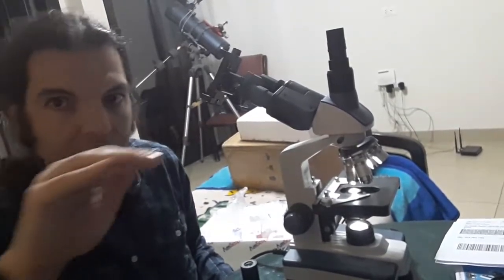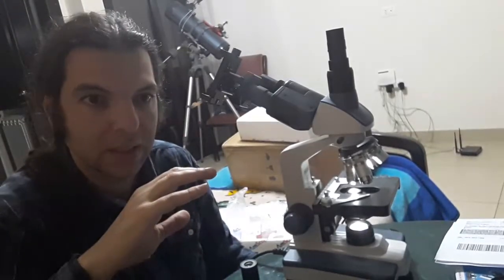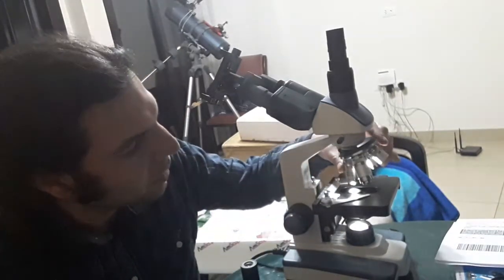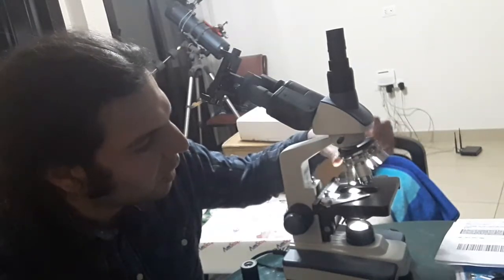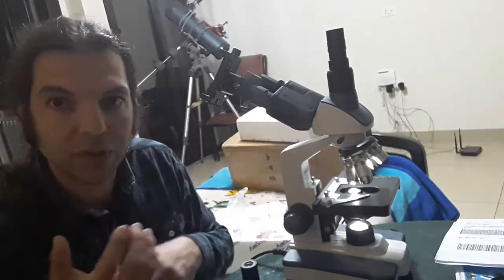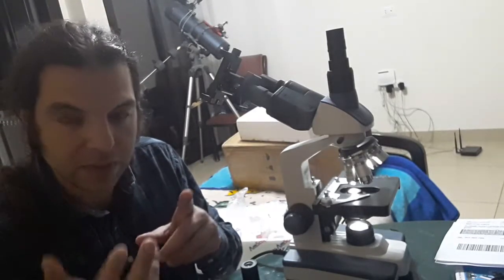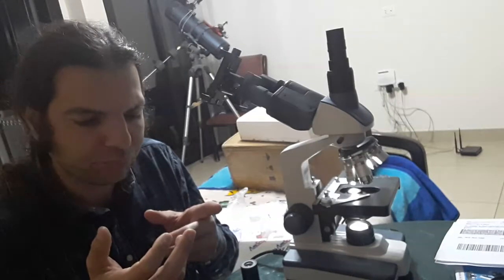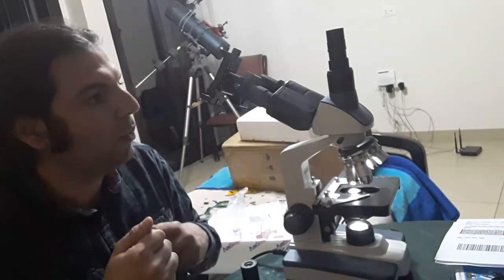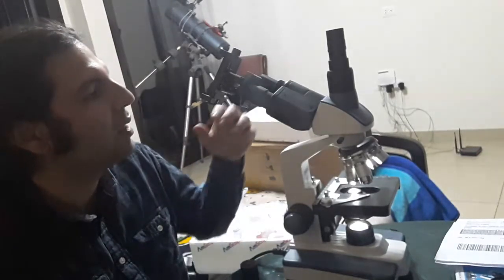You can take pictures with it, but the orientation is landscape, not portrait — I'll tell you how later. The microscope comes with objective lenses of 4x, 10x, and 40x magnification power, plus a 100x objective.